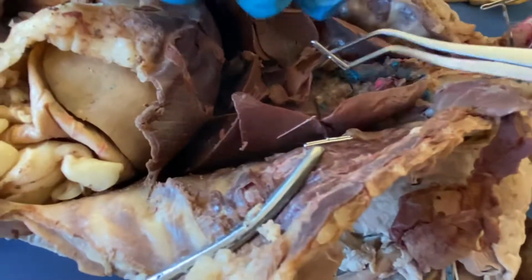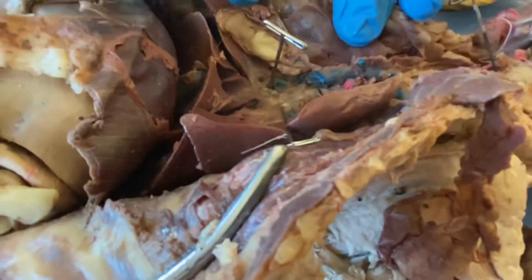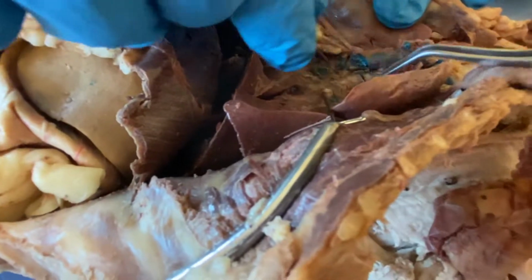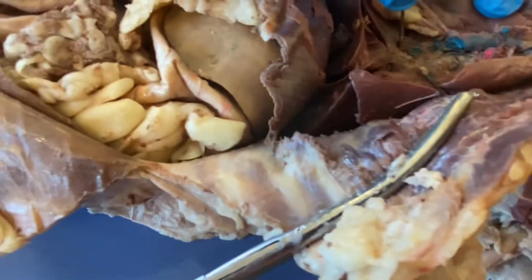I'm going to follow that all the way down to the right and left primary bronchi. A little bit difficult to tell. We did remove our heart, so hopefully you can see a little bit, but it does branch here. It's a little bit hard for you to potentially see that though.